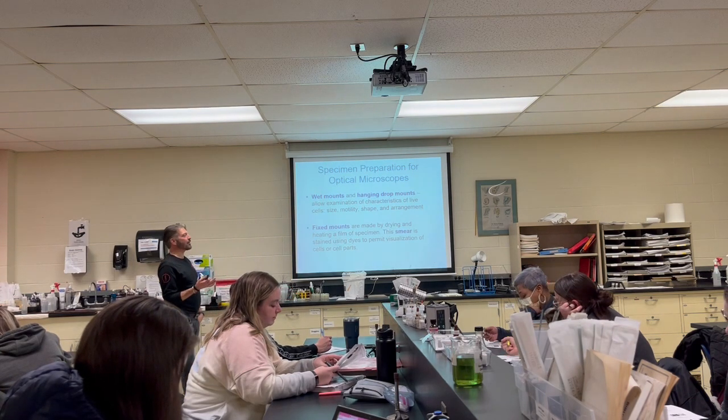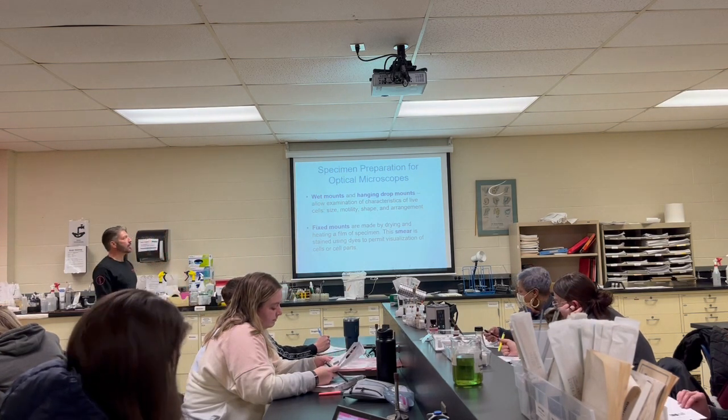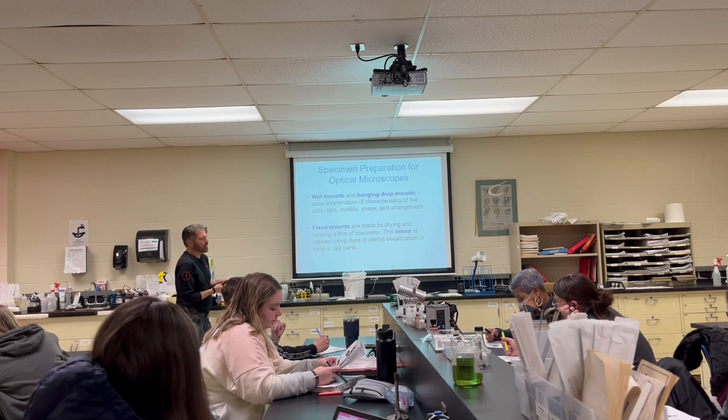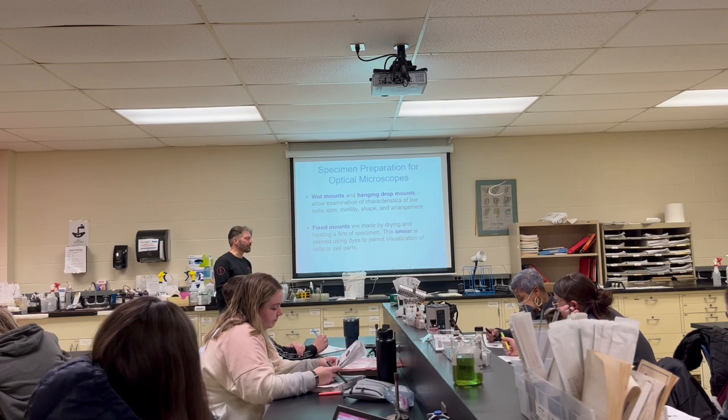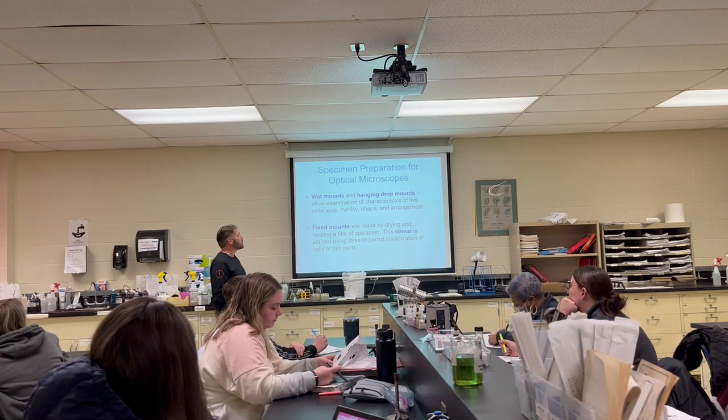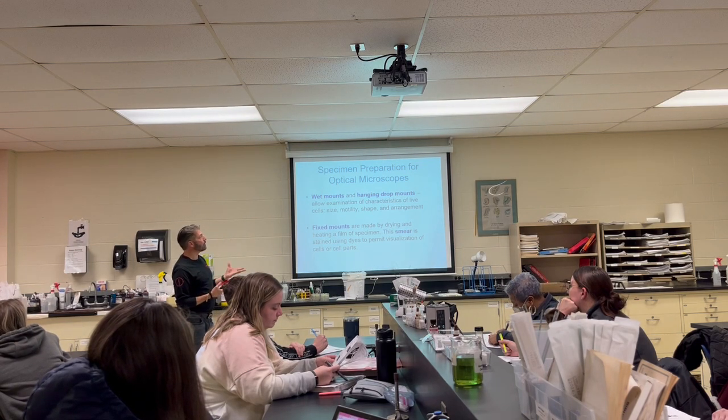Okay, let's get to something that's actually fun and important: wet mounts and hanging drop mounts. We can do these if anyone wants to. I don't, because we're not going to be looking at pond water and things like that. We could, but here I'm going to focus on things that are microscopic that you're going to see in healthcare. Wet mounts and hanging drop mounts examine the characteristics of live cells.